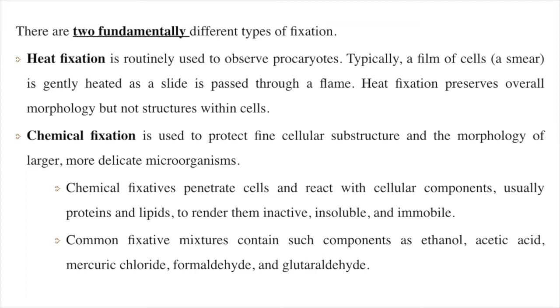The next one is chemical fixation. Chemical fixation means we are fixing the cells by using a particular chemical. The chemical fixation is used to protect the fine cellular substructure and the morphology of larger, more delicate microorganisms. What is a chemical fixative? It is the chemical agent used to fix the microbial cells. These chemical fixatives penetrate the cells and react with the cellular components.